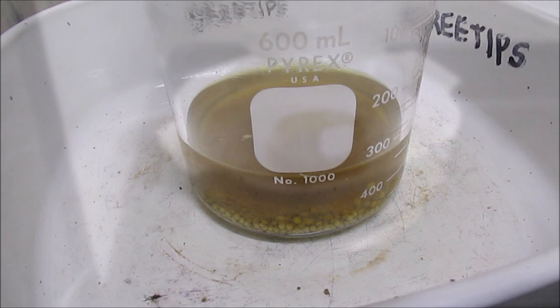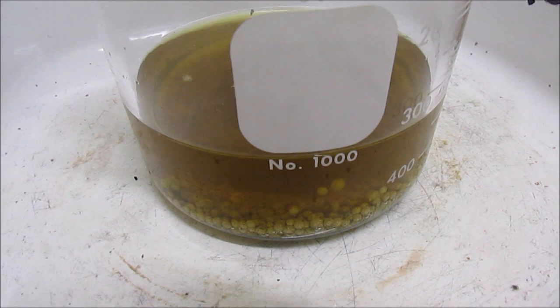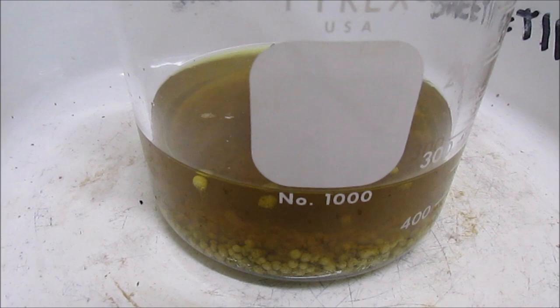And here you can see what's happening as I hit it with the hydrochloric acid. Some little balls are forming in there. I don't know exactly what that is. We'll just keep continuing with the process here and keep you updated on what's going on.